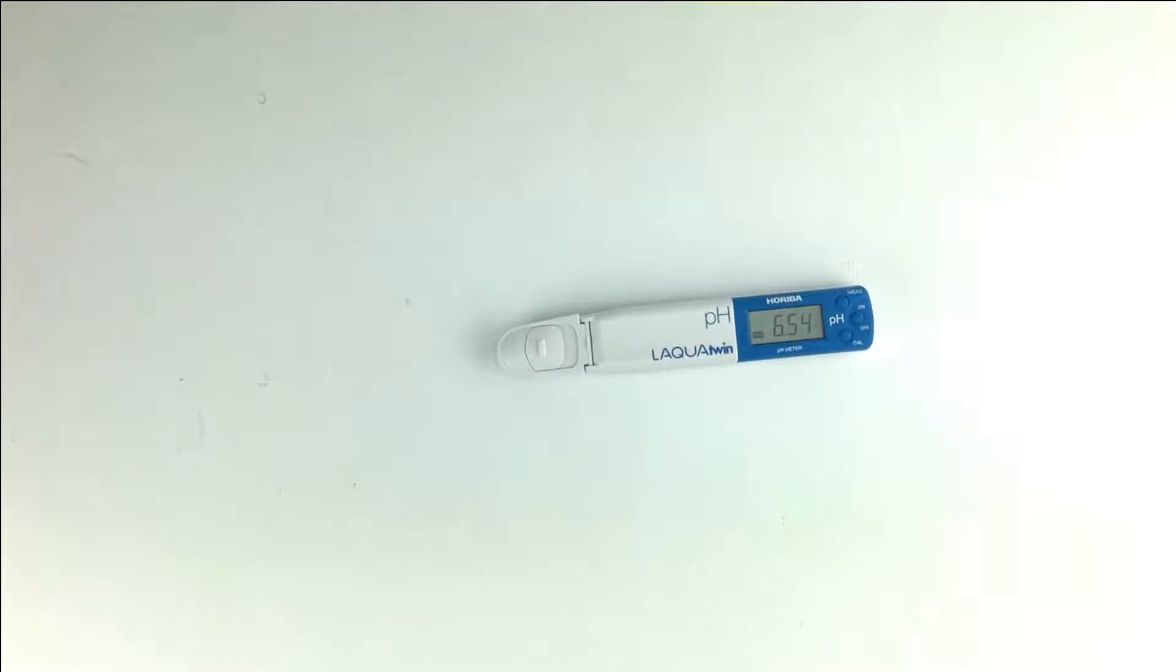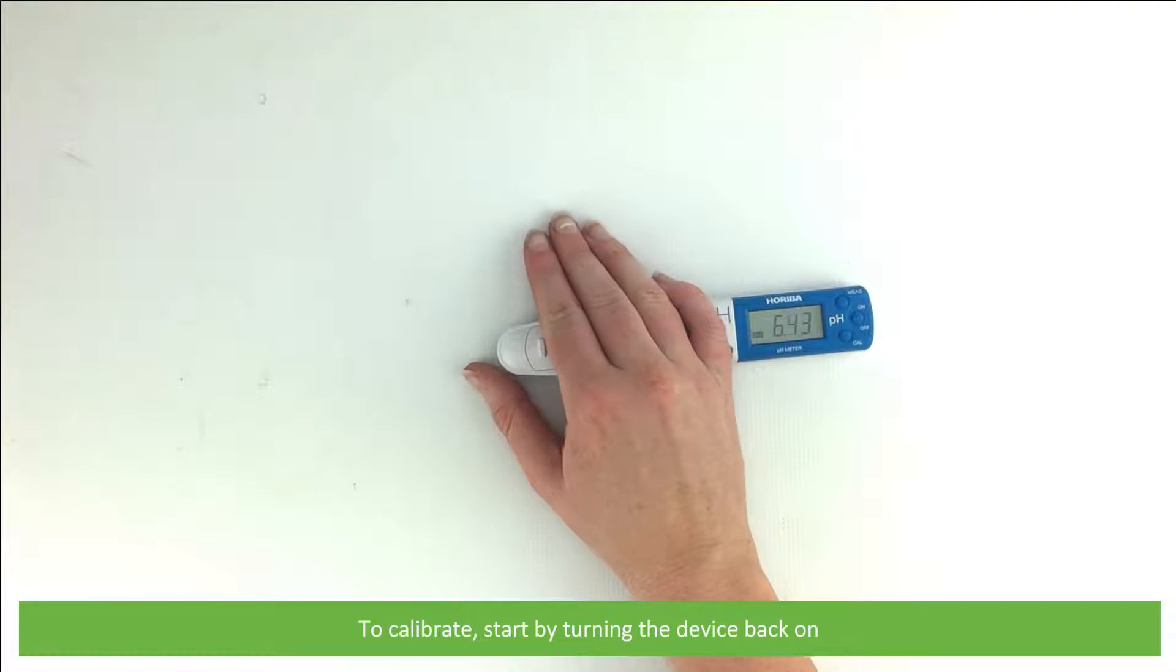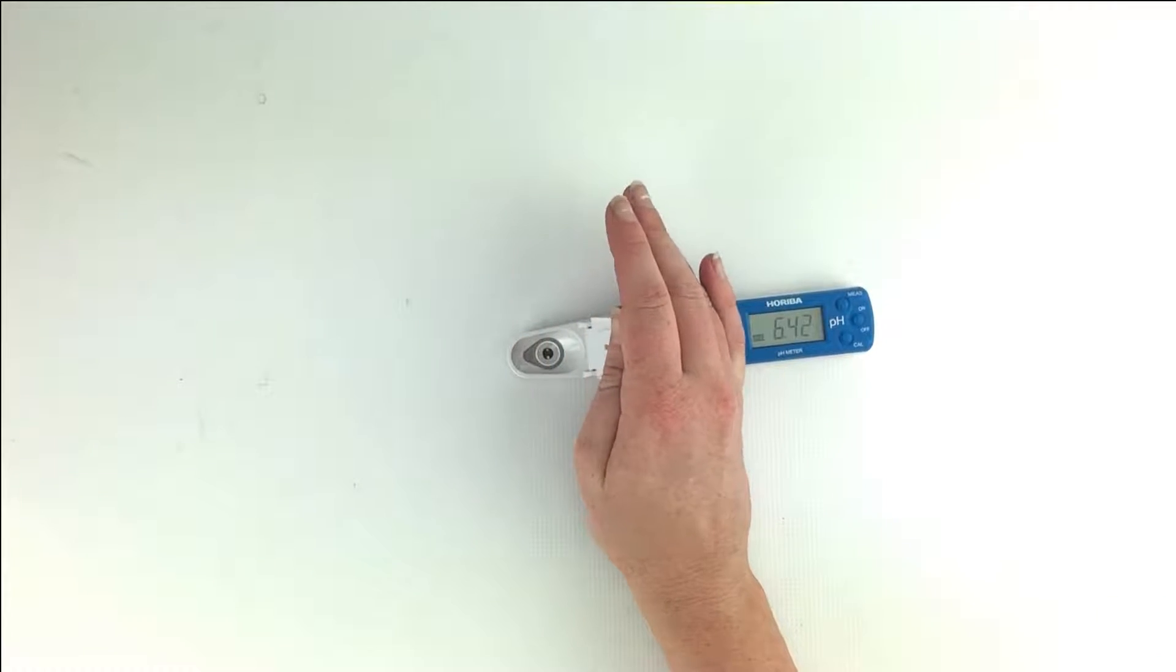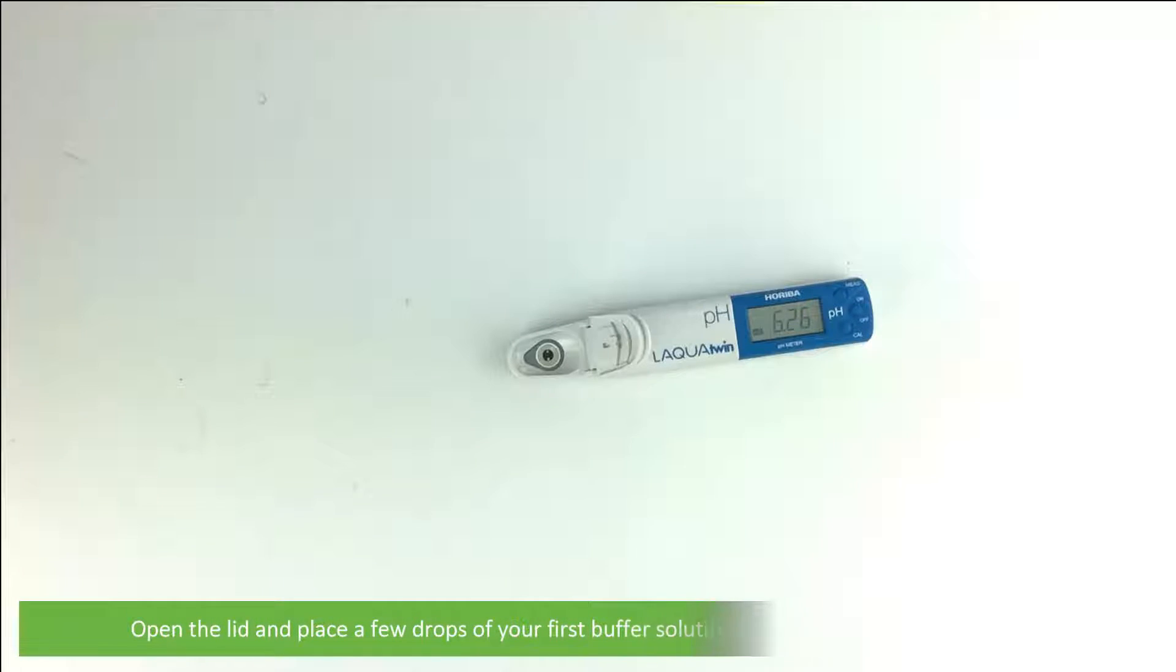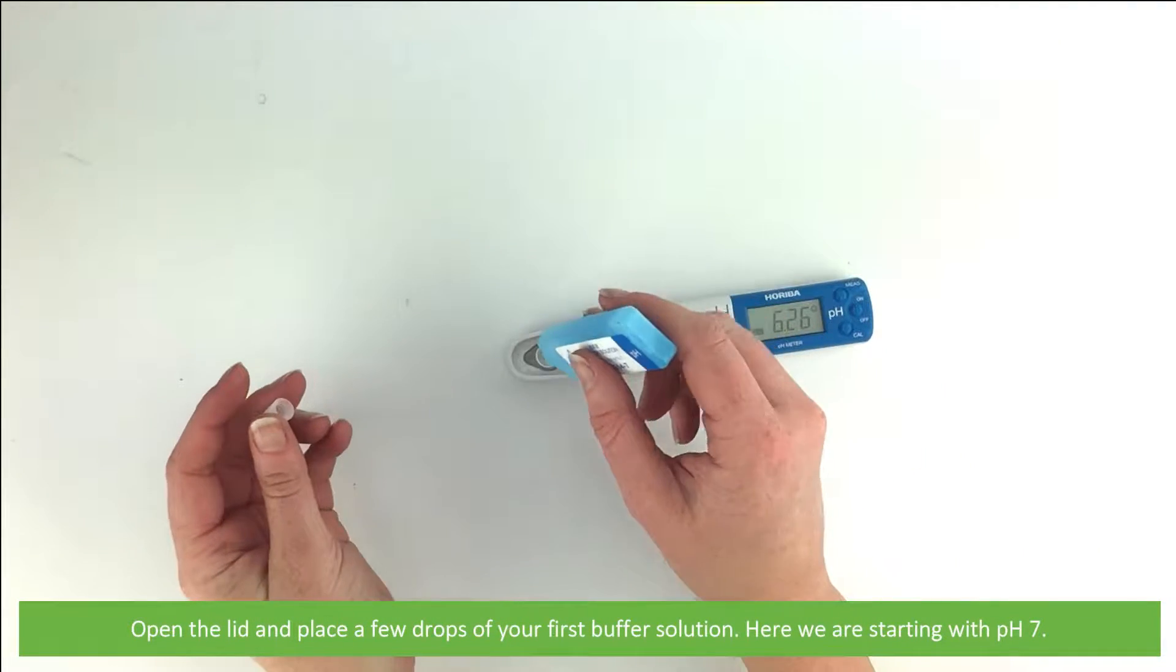To calibrate, start by turning the device back on. Open the lid and place a few drops of your first buffer solution. Here we are starting with pH 7.